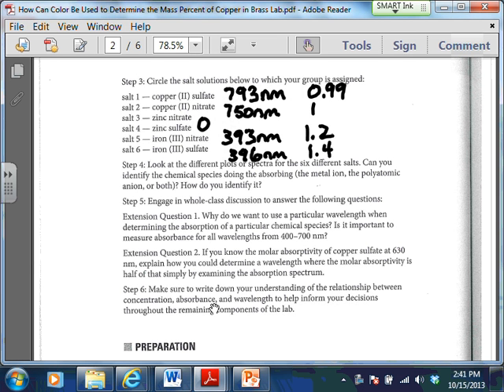I think what we'll probably do tomorrow, the nice thing about the data that you get when you measure this tomorrow, is you can see where the peak is going to be, so you can measure right at the peak absorbance. It's not as big a deal with the equipment we have to know exactly what wavelength to set it at. Using the old ancient spectrophotometers we've had here in the past, you have to set it for one particular wavelength, and then you're measuring the absorbance at that wavelength. That's when it would be really important, but with the equipment we have, it's not as important.